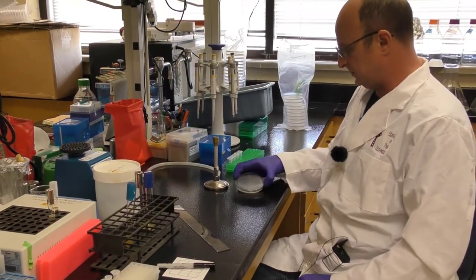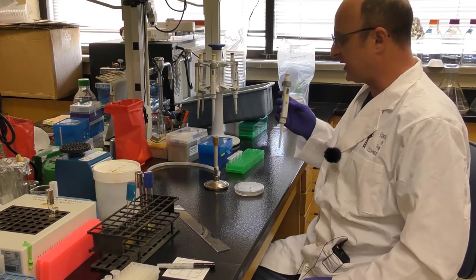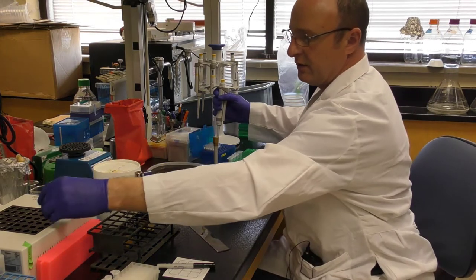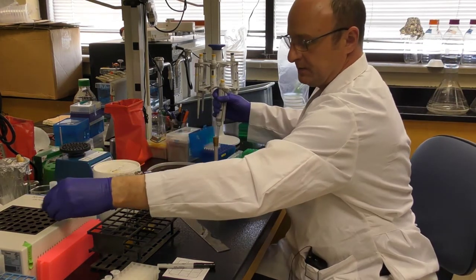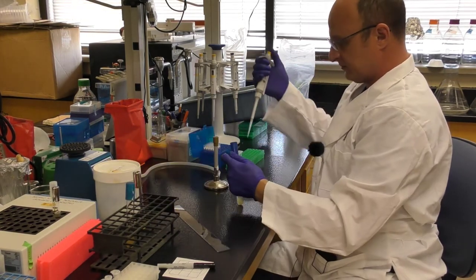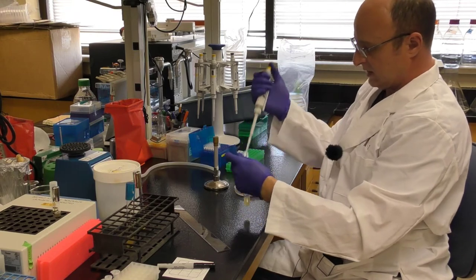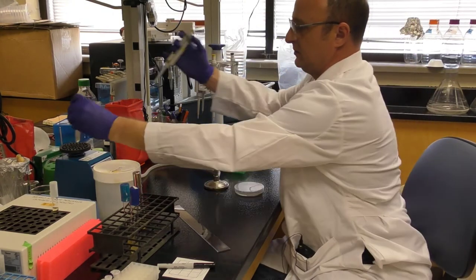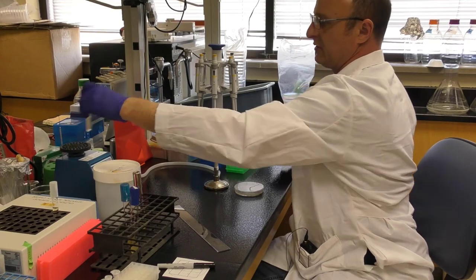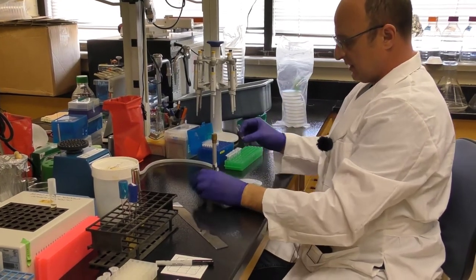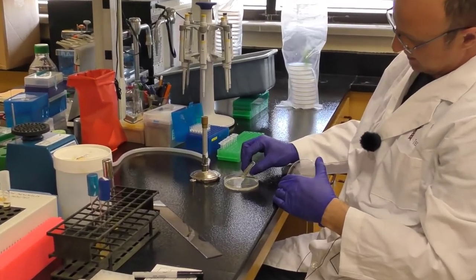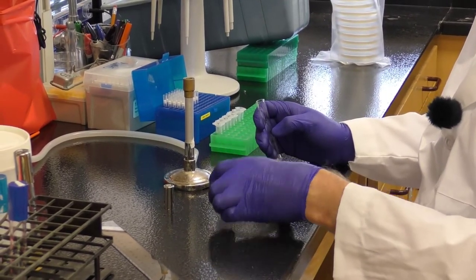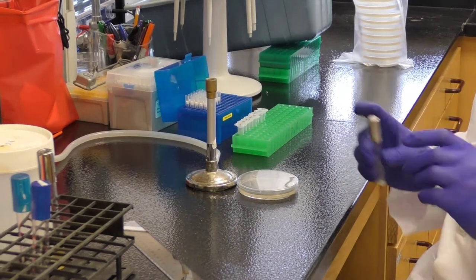So now we're ready, we will pour our lawn. I have my pipette set to 100 microliters or whatever the required volume would be for your cells. I have four mils of molten top agar that's in the hot block at 55 degrees. Take my aliquot of cells, add it to my top agar. Vortex on a low speed. You don't want to introduce a lot of bubbles because bubbles will look like plaques. Flame the top of the tube. And then carefully, slowly but in one movement, dump those cells onto the lawn, onto the plate. Give it a swirl as before and we'll let it set.